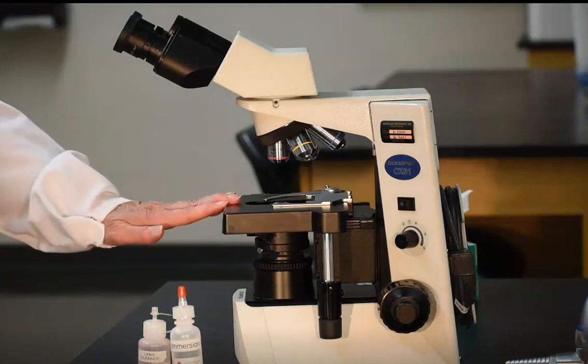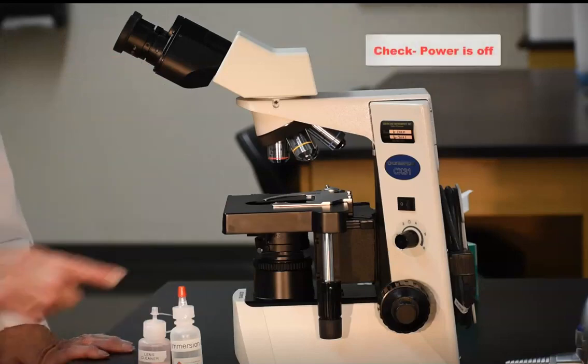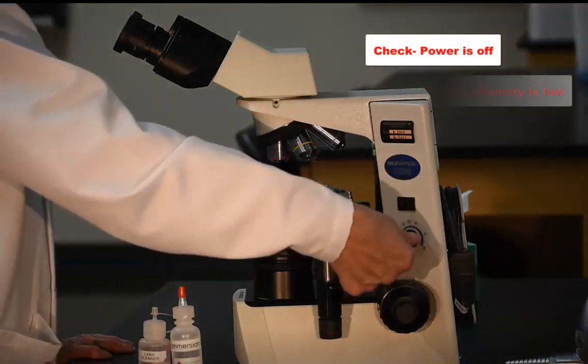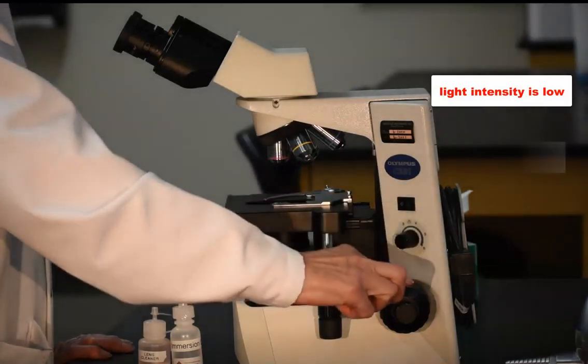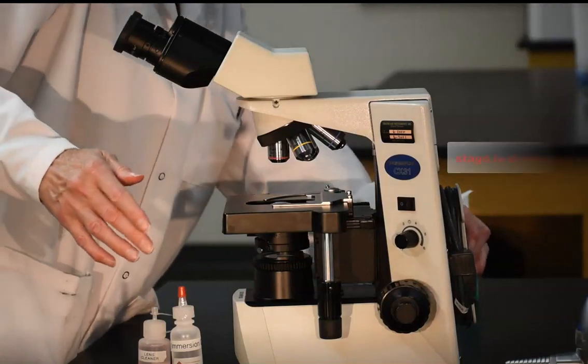Set the microscope on the counter with the stage facing you. The oculars should be over the stage. Before you plug in your microscope, check that the power was switched off and the light intensity is lowered. This will preserve your bulb life. The stage should also be lowered.